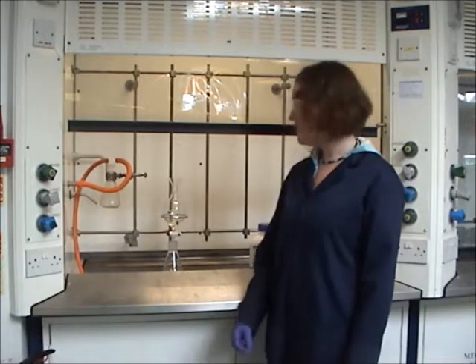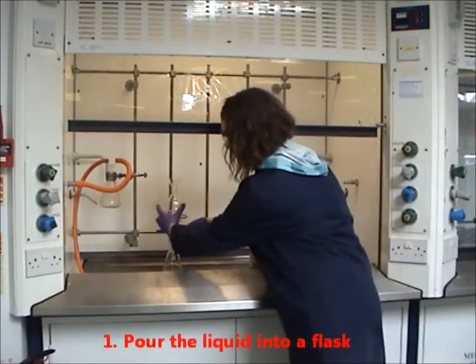I'm going to show you how to dry a liquid, for example, after an extraction. First, pour the liquid into a flask.